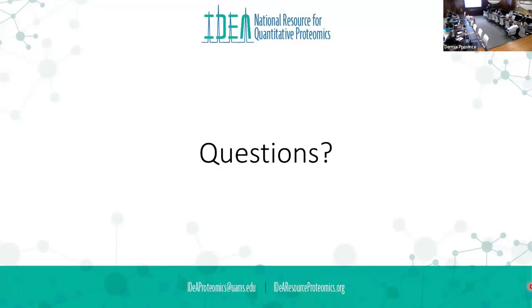And I didn't talk about phospho-DIA because in our lab, it's not really a thing yet. It will be. There are papers on it. There's software that does it now. The DIA-NN package allows you to do that. There are technical issues that we need to overcome before we can do that with DIA and even the enrichment.